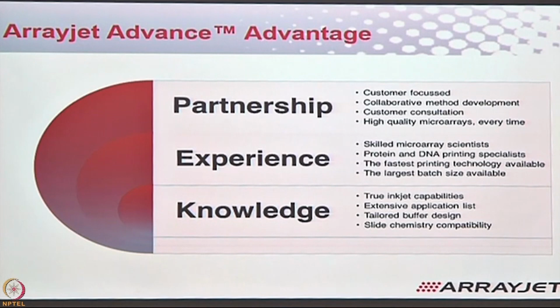Because it's fast, we are able to do a lot of printing for a lot of students quickly. So in a day, we can finish off a lot of projects. So you don't have to wait for your results or your reports.